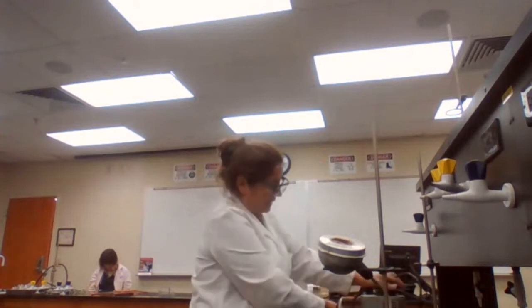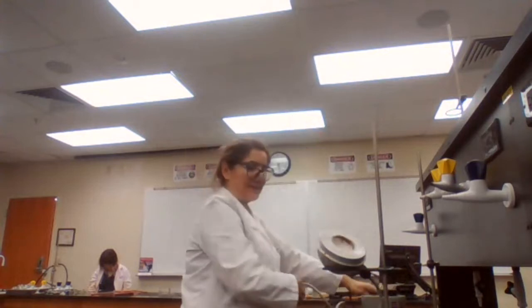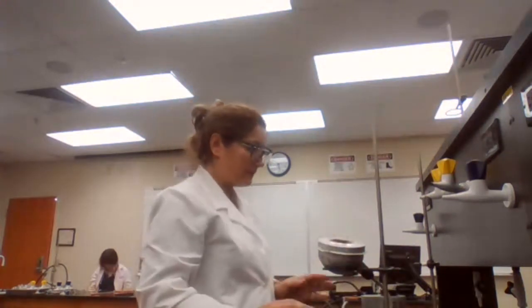I'm not going to connect the power regulator to the wall, or if I do connect, I'm not turning it on. That would be the last step. First, we are going to work on the assembly of the distillation.